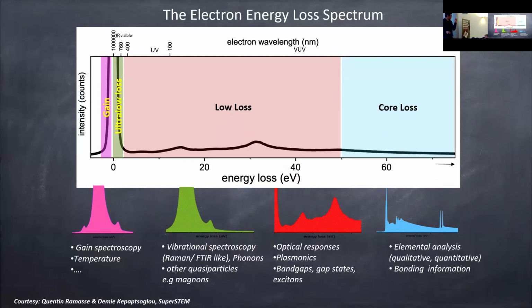The idea, the logic here is, how do we do EELS to quantify elements, oxidation state, thickness, and then other things that you don't think are possible with EELS, but it can be done. And today I'm going to show you some examples of that.